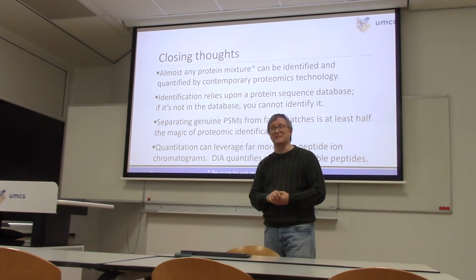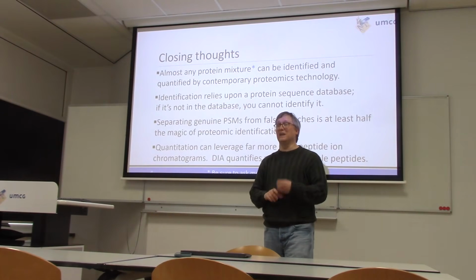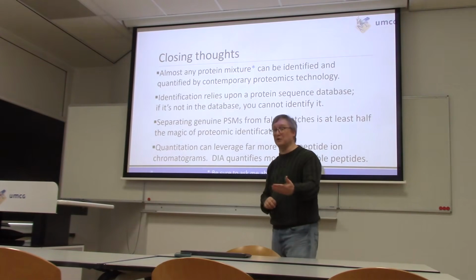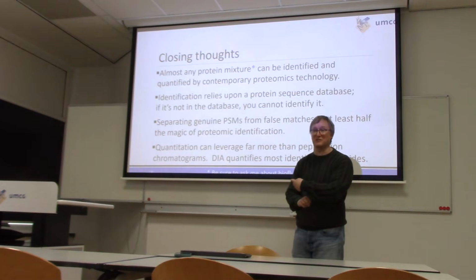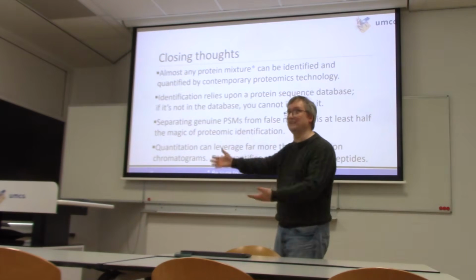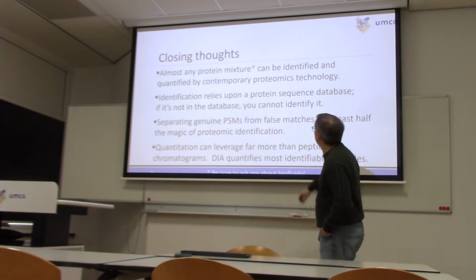So you can do it. But if you don't know that a peptide sequence exists somehow, it's going to be really difficult for you to go about identifying it in database search, because what's in the database is its search space. That defines what it's able to detect.